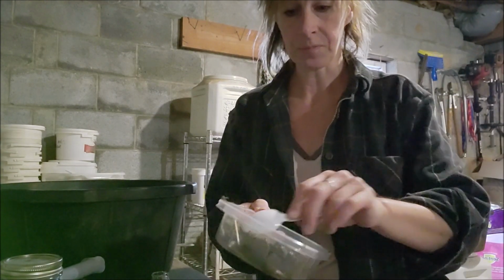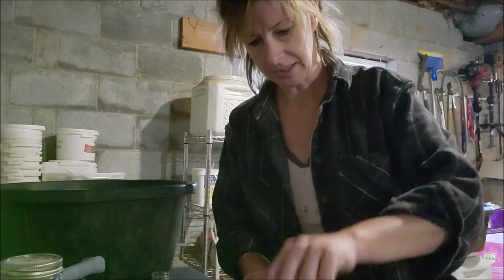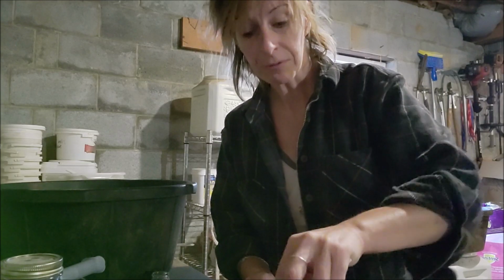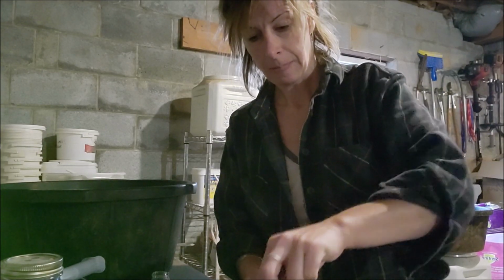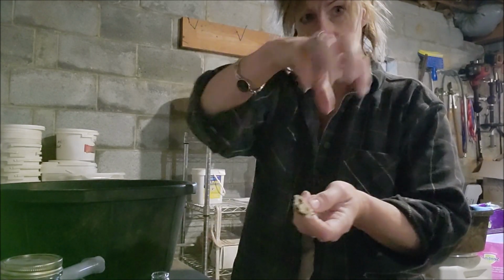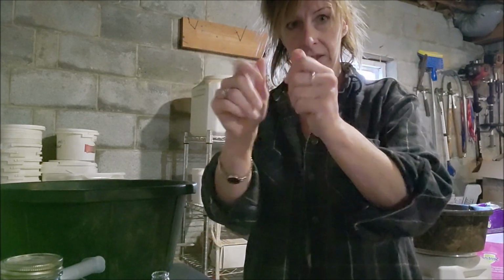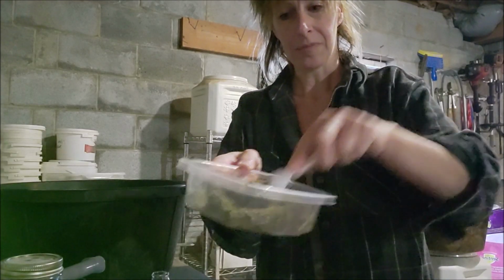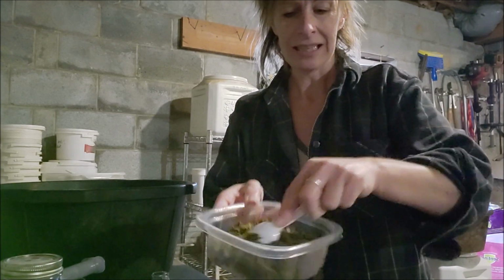First thing that you want to do is mix it all up. Have a good plastic spoon, or I prefer this in a plastic bag, like a sandwich bag, and that's easier to collect it too. So you take the sandwich bag and you turn it inside out and you can pick it all up and then turn it right side in, and it's easy. And then you ziplock it and squish it all up. But since I don't have any ziplock bags, I'm just going to mix it all up, chunk it up a little bit.